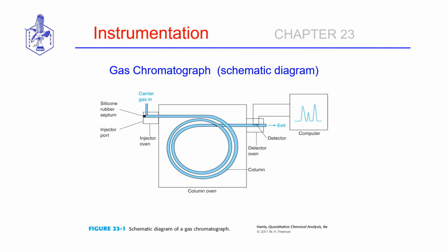To use GC, our analyte species of interest, whether it's in a solution phase, a liquid, or a solid that's been put into a solution phase, if you can readily get that analyte species up into the gaseous phase without degrading it and at reasonable temperatures, then that substance can be analyzed by gas chromatography.